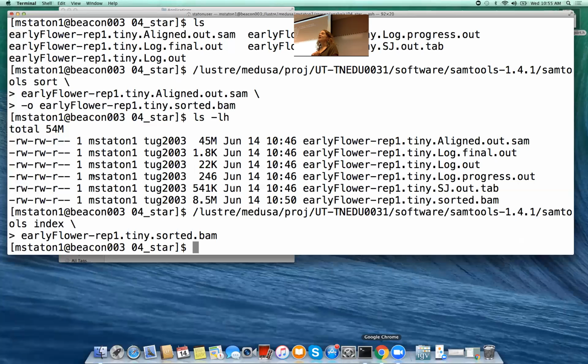So we have on the lesson plan the paths that you need to go get. Is it cut off on anybody else's? Anyway, you should be able to copy it. You need the genome. We have indexed the genome. You need the BAM file, and you need the index for the BAM file. So you should end up with 4 files. This ppersica.fa, this ppersica.fa.fai. You'll also want to get your GFF3 files so you can see where the genes are. The BAM file and the BAI file.